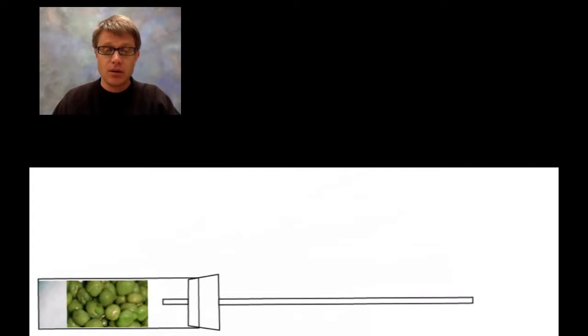So let's look at what happens. We take our respirometer, we're going to put it under water and we're going to let it set and equilibrate. Basically what you'll get is a little air bubble that forms right here. So there's going to be oxygen inside here, oxygen is going to go all the way out here, and then water is going to start to creep in over here. So now we let it sit.